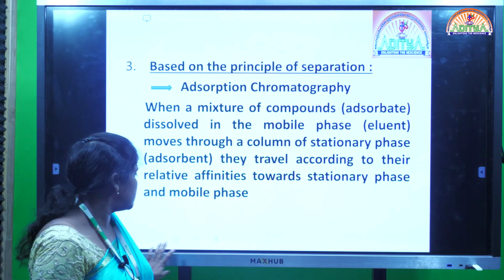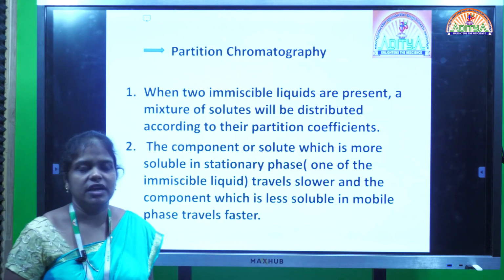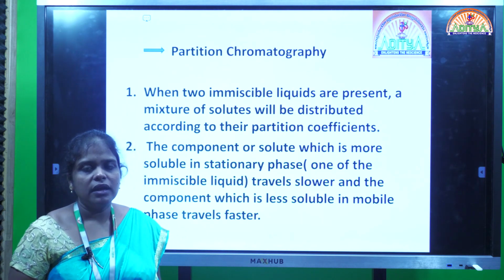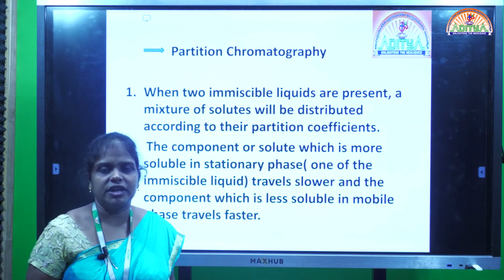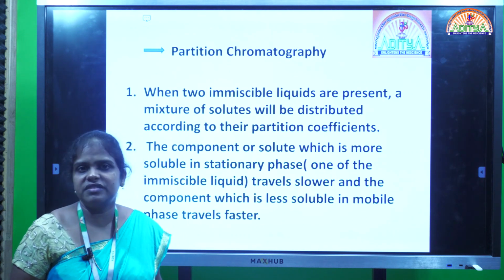The other principle of separation is partition chromatography. Partition chromatography means the stationary phase and mobile phase, both are liquids. For example, oil and water. Oil and water are both immiscible, they will not mix with each other.